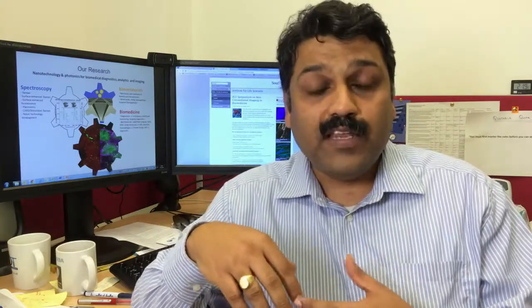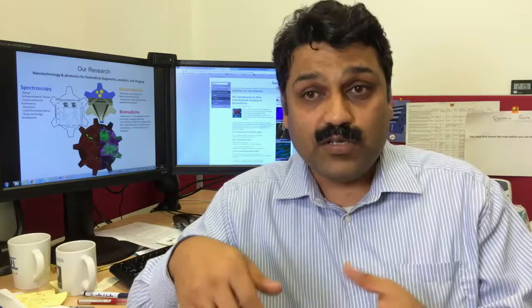And this sounds like it will have huge clinical impact. What do you think the significance will be to the delivery of healthcare? Yeah, I think it could have a serious and large impact, because imagine, for example, in tumor surgeries, if the surgeon was able to look at the tumor in real time and decide with precise margins, and therefore takes out no more than what is required, then it could mean huge saving in resources, both in terms of the time spent and better outcomes for the patients. But also there will be less chance of recurrence for that tumor to come back, and therefore it saves money, time, everything for the NHS actually.